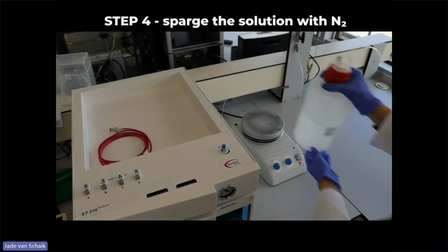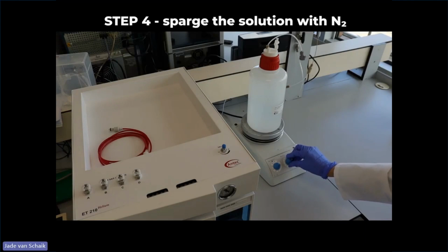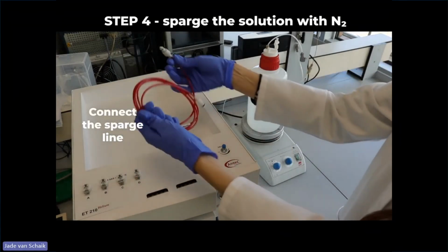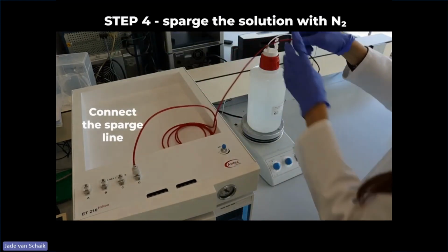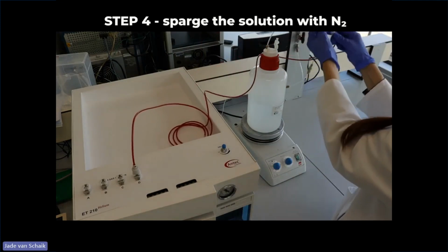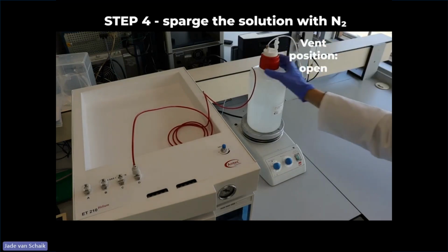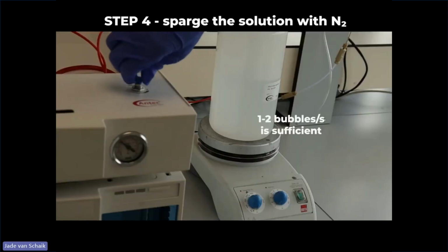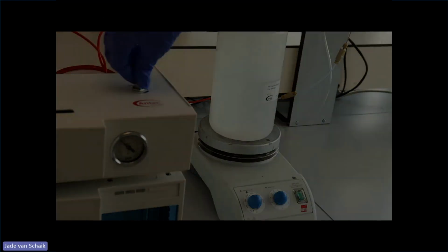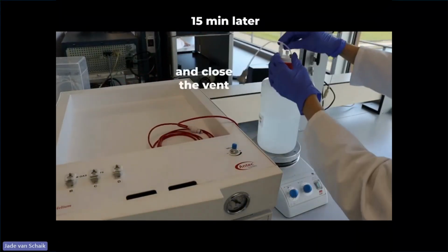Place the bottle with water on a magnetic stirrer, and the water is degassed further by sparging it with nitrogen gas. Therefore, the sparge line is connected to the ET210 eluent tray, and the other end of the line is connected to the bottle. Make sure to open the vent. Have a look at the sparging speed and adjust if needed. 1 or 2 bubbles per second is sufficient. 15 minutes later, the bottle can be disconnected. Make sure to close the vent.